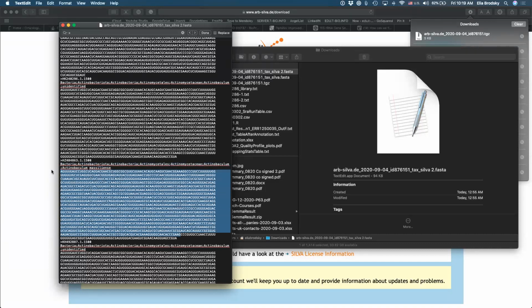Now, when we are doing our mapping, as you saw, it doesn't have to be perfect. The reason for that is because we have a whole variety of unknown organisms that we just don't have any annotation for. So we can use this flexible mapping so that we allow for some mistakes. Imagine that this is the sequence, right? And you have a number of reads.